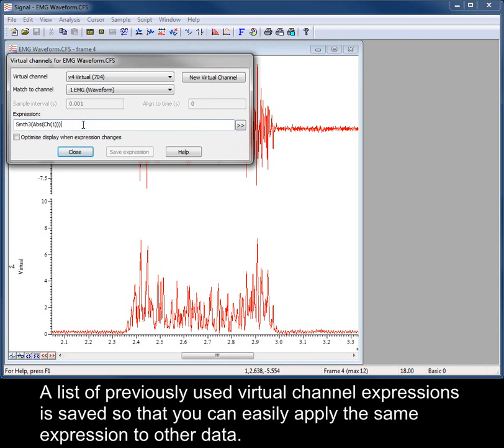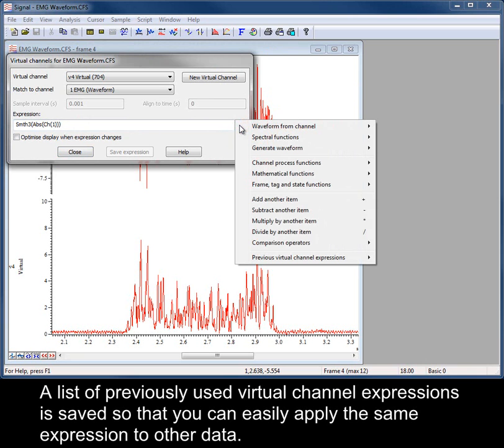A list of previously used virtual channel expressions is saved so that you can easily apply the same expression to other data.